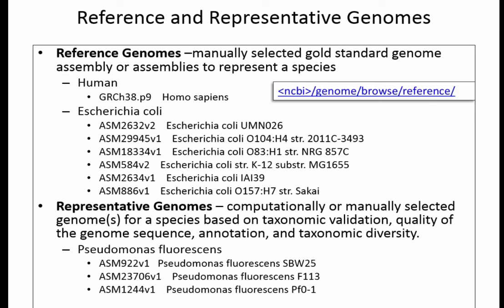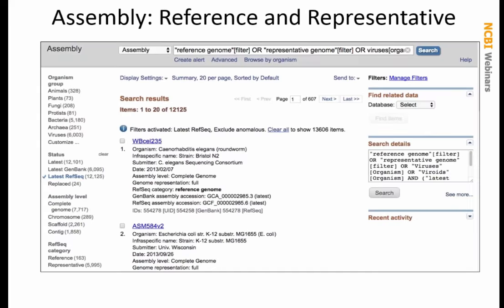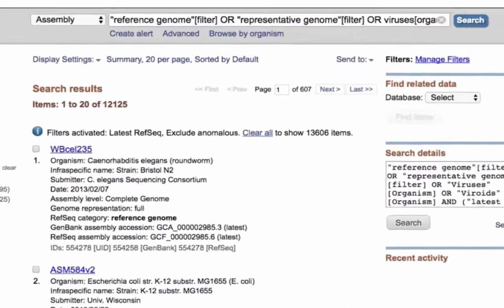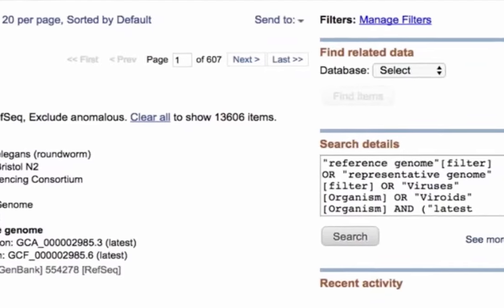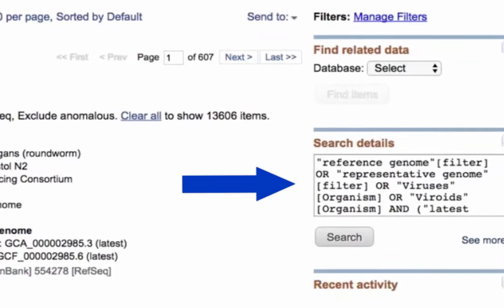For example, Pseudomonas fluorescens has three different representative genomes with different assembly identifiers. To find these on the web, you can go to the Assembly database and do a search using the appropriate query. The database we're searching today has about 12,000 different assemblies. One caveat: viral genomes are not covered by the standard reference or representative filter, so a more complex search is needed to retrieve those.